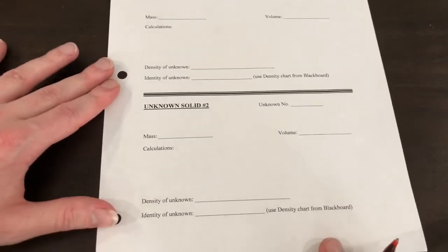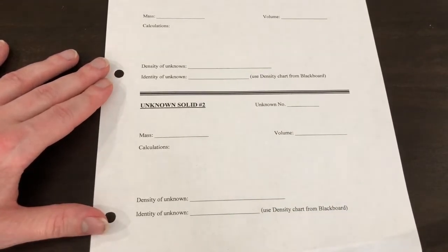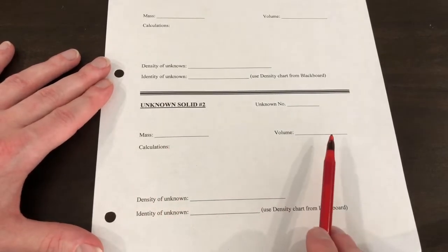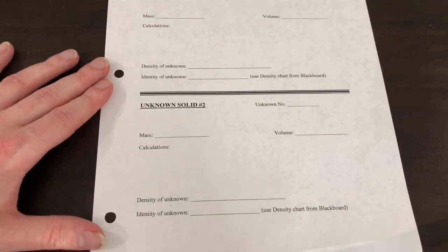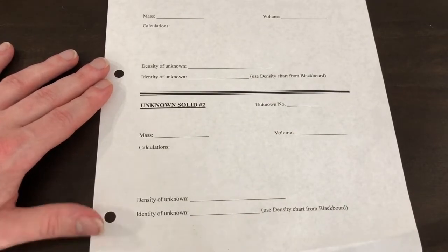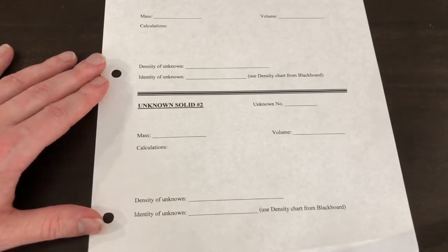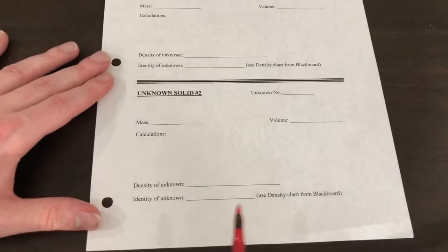Now, our unknown solid 2 is the gold-ish looking one, okay? So we found the mass from the scale. Our volume is found by length times width times height. And we find the density of the unknown by doing mass divided by volume, okay? So we should get something close to the density of aluminum, and we should get something close to the density of brass.